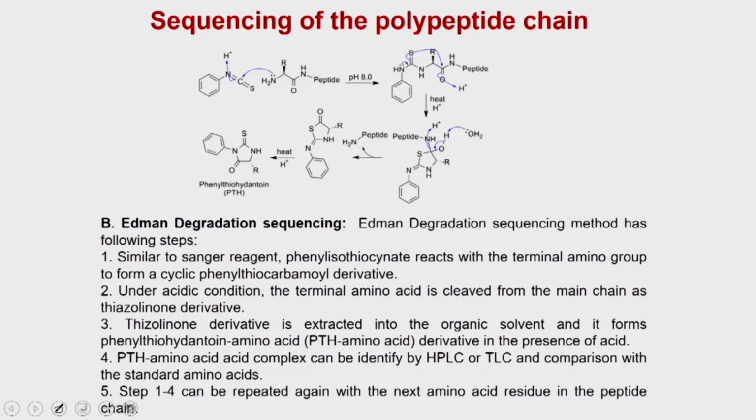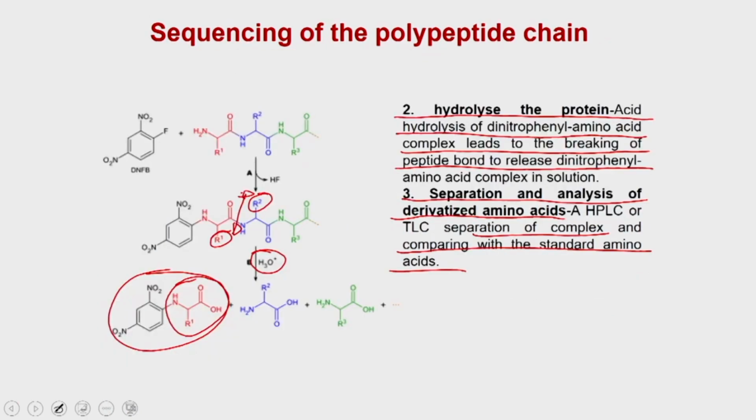In an alternate method of sequencing of the polypeptide chain, so this method that we have discussed so far is the method developed by Sanger, and that is why it is called the Sanger sequencing technique.